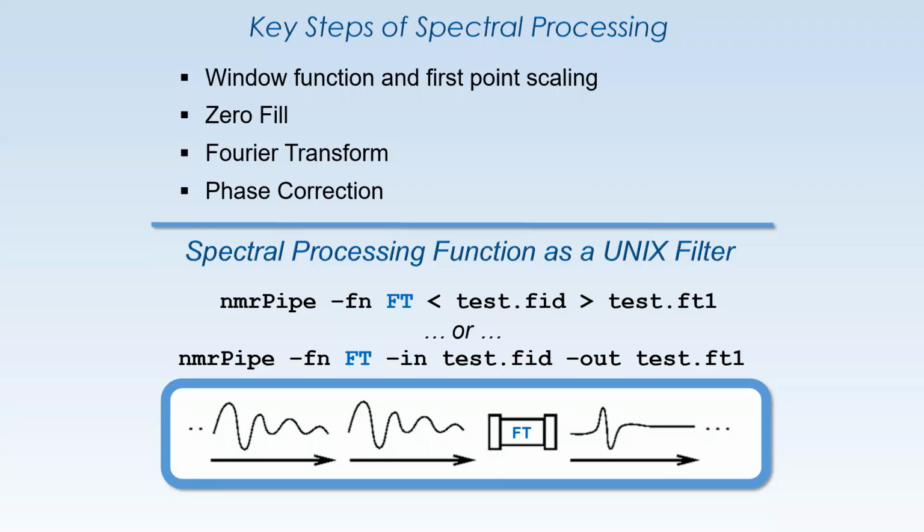As we also mentioned, one of the ways you can test this is to resample your own conventional data and see how it would have behaved if it was a non-uniformly sampled spectrum. We're going to see how to do that a little later. So first, I will make a little introduction of the NMRPipe software for the folks in the audience who haven't used it before or aren't familiar. Then we'll stop with the slides and actually poke around with some software. During these discussions, I won't be able to see if there are questions because of the way I have my screens arranged.